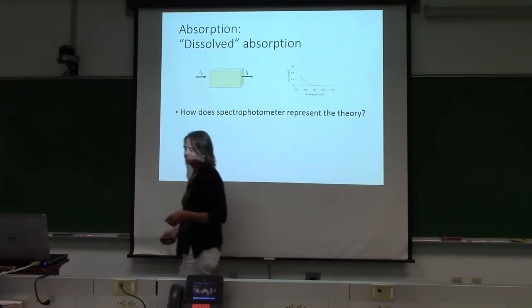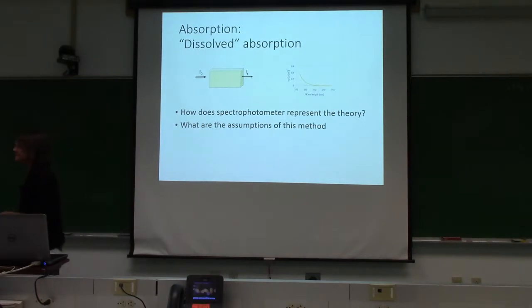It's a little bit off topic from that, but since you mentioned this, CDOM is very photosensitive. Yes. It degrades really fast with light. And that also changes not only the magnitude, but also the slope. Yes, it does. It often makes the slope steeper, and it reduces the magnitude. So when you filter, you want to do it in a dark room. My lab basically never has the lights on. My technician walks around by feel in my lab.